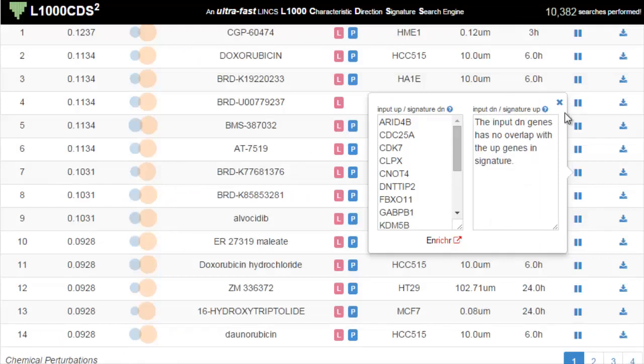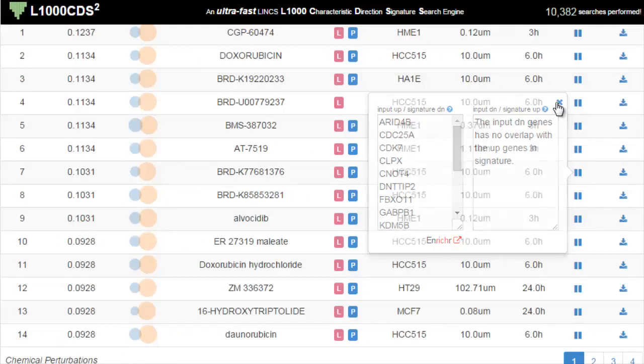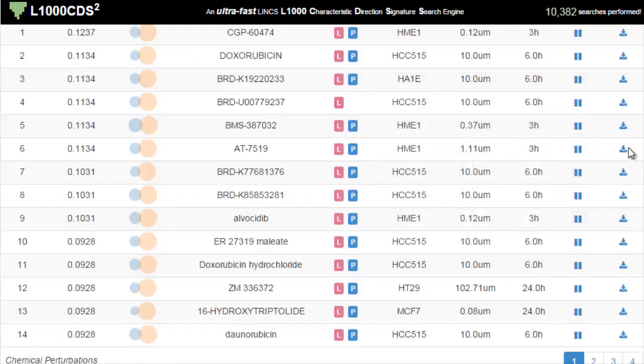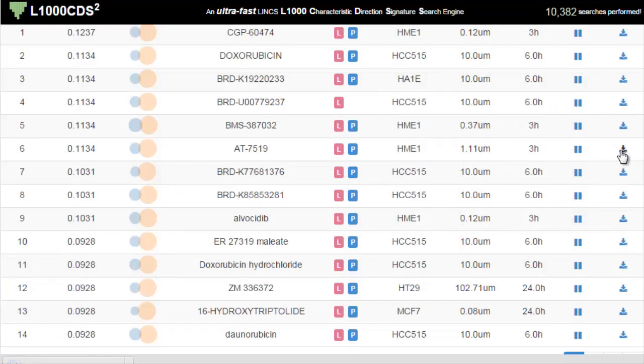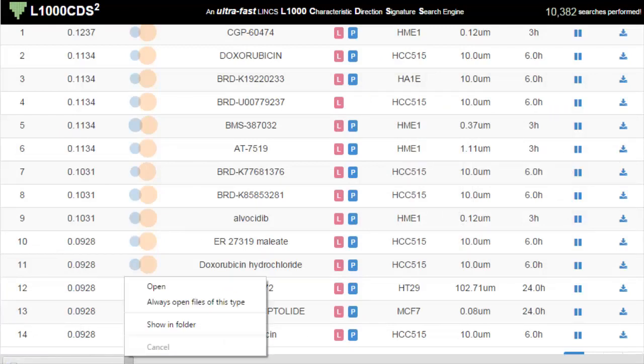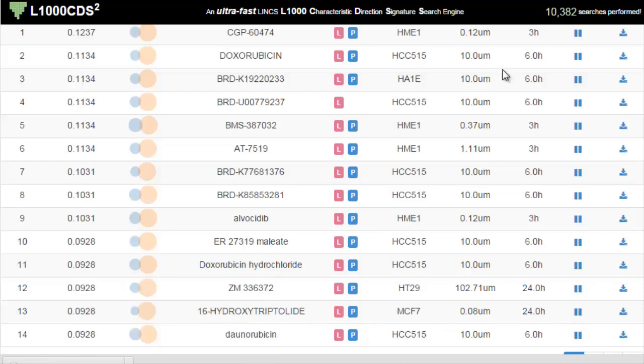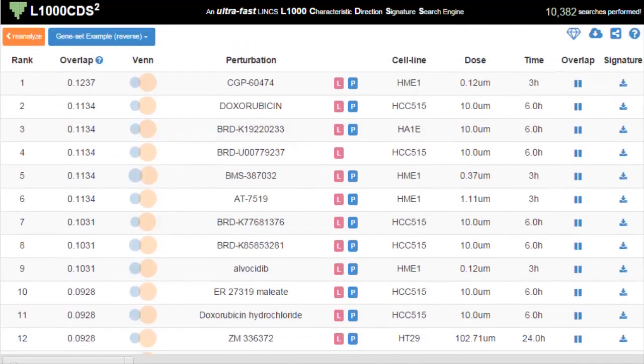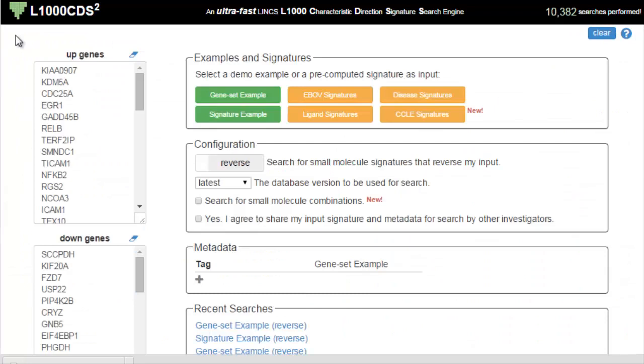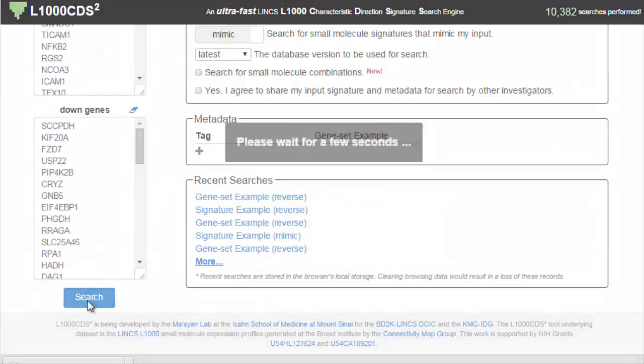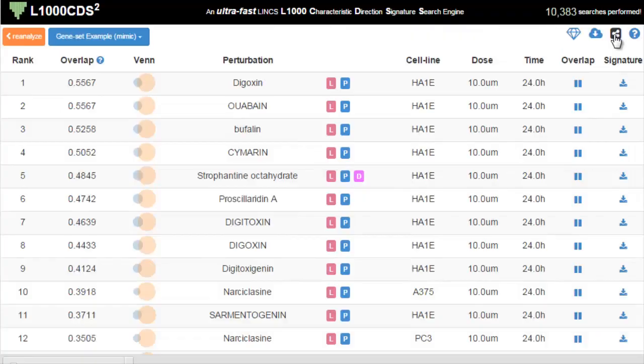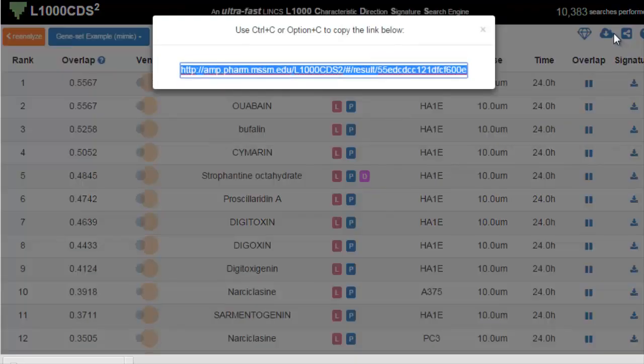Clicking the download button will allow you to download all the information about the signatures as a JavaScript Object Notation or JSON. On top of the table are buttons and icons that provide various useful services. For example, you can re-analyze the input, and this will redirect you back to the input page where you can change some input settings. For example, you can switch between mimic and reverse. You can also share your results with others by providing them with a permanent link.